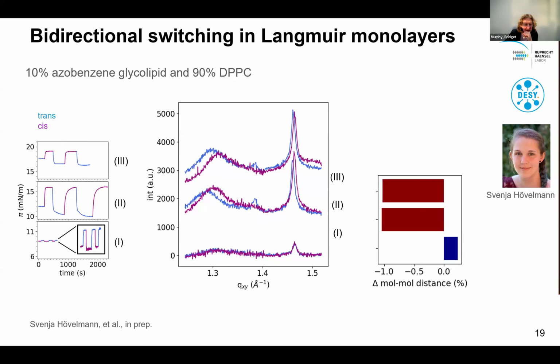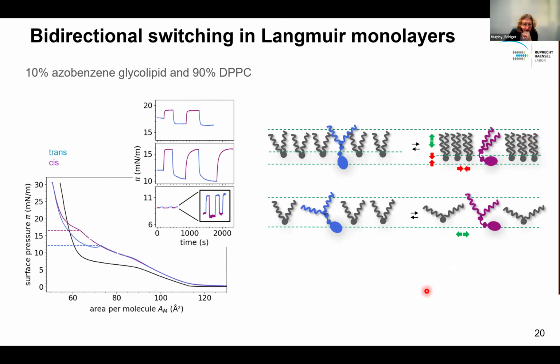And indeed, using the grazing incidence diffraction, we can now, between a combination of X-ray and neutron reflectivity, confirm that the switching is between the head and the tail, and we can also confirm that this increase in the difference between the head groups is for real.